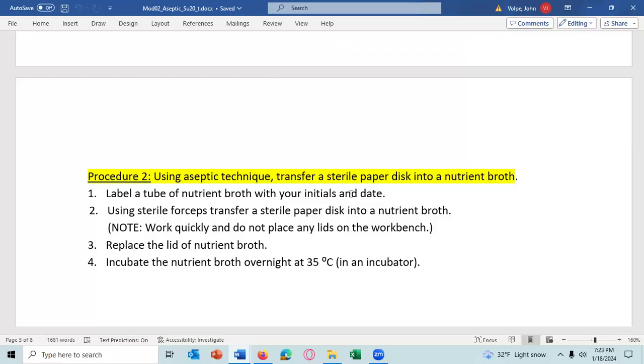So how you clean them is you put the tip of the forceps in the Bacti-cinerator just for a little bit. You don't get it red hot. You just heat them up a little bit, and then take them out, and then take the forceps and stick it in some alcohol. Take the forceps out and put it back in the Bacti-cinerator. You should see the Bacti-cinerator lighting the alcohol on the forceps. That will clean the forceps. It won't be sterile, but it will be good enough for this use, meaning there will be very little bacteria on the forceps.